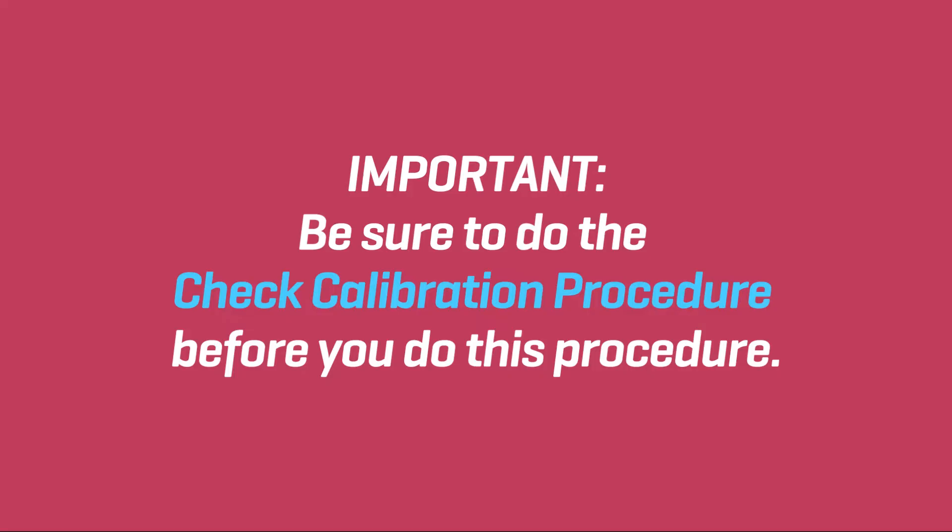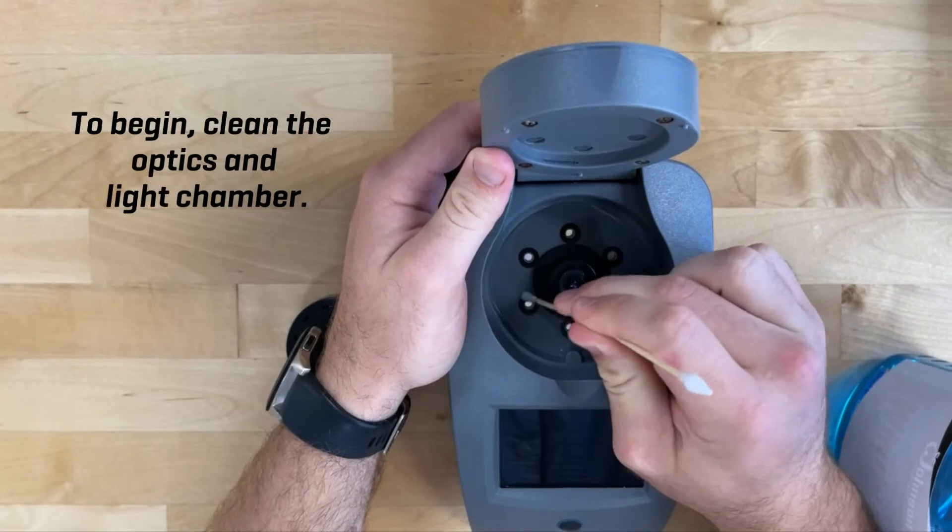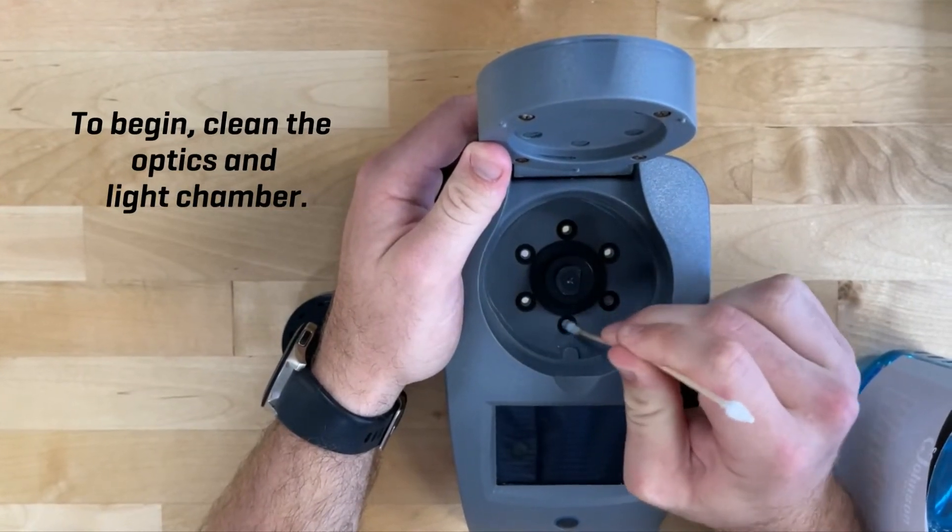Be sure to do the check calibration procedure before you do this procedure. Do not try to separate the components of the disk. To begin, clean the optics and the light chamber.